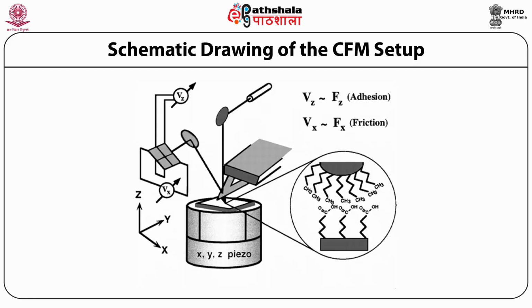In principle, the magnitude of intermolecular interactions can be assessed directly in an adhesion measurement. Adhesive interactions between different functional groups are different, from the force versus sample displacement, that is FD curves.